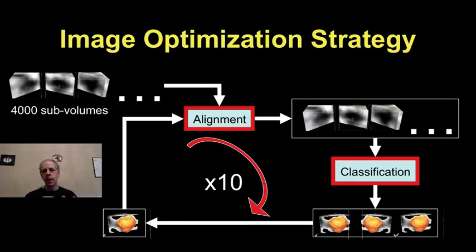And you repeat that for a number of iterations until you're satisfied either that things are not changing too much, or basically you say, this is the best I can do, so I'm going to stick with that. And that's a process. We define a distance, we do alignment, clustering, alignment, clustering. And the big thing here, once again, and we're going to come again and again to that, is we have a lot of these small boxes.